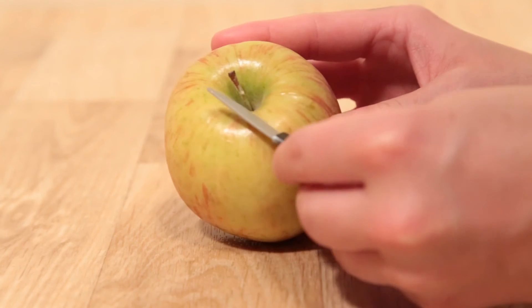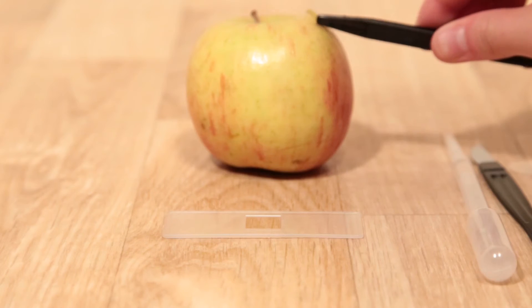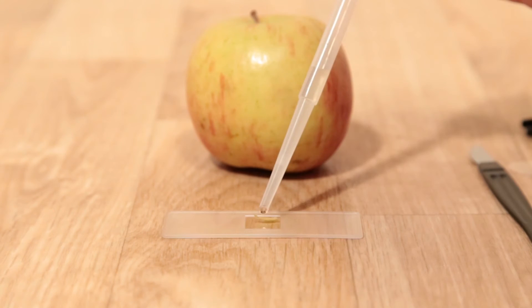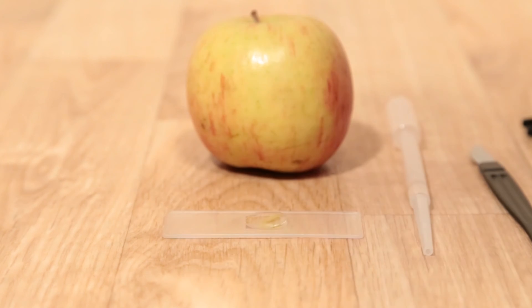You can even make your own slides by using the included scalpel to slice your sample, then use the tweezers to place it on the slide. Add a drop of water with the pipette, then cover it with a temporary plastic slide, and you're ready to go.